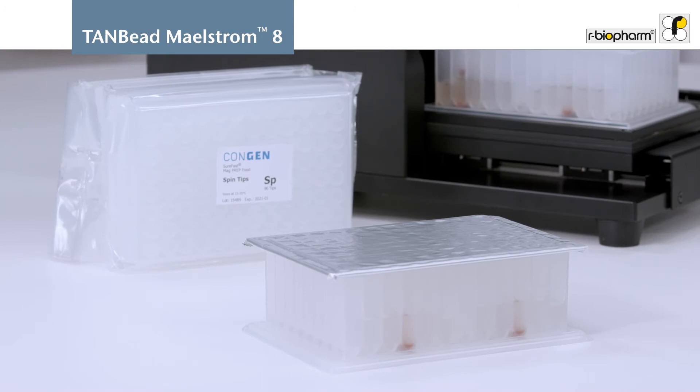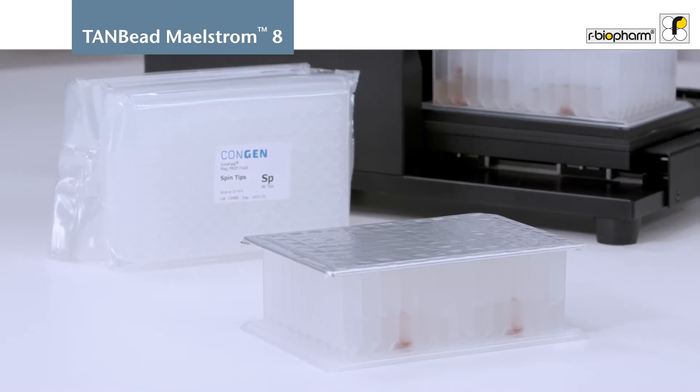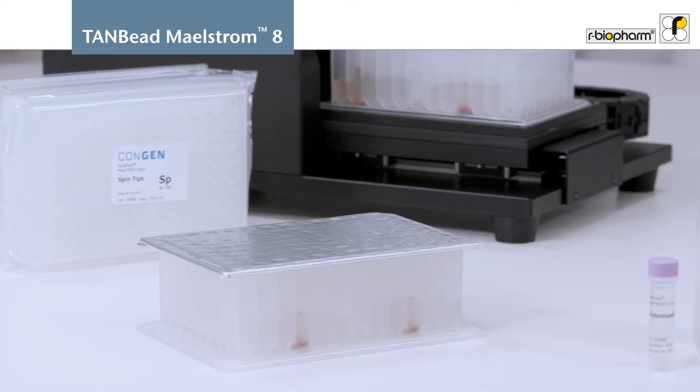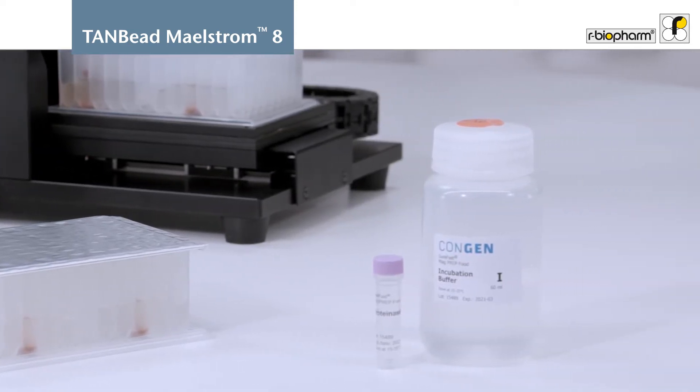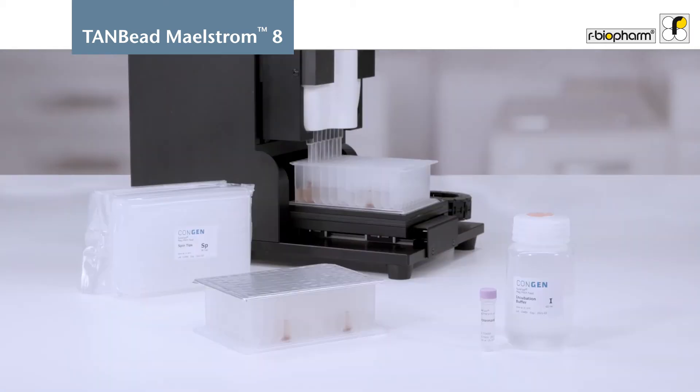The customized SureFast Mag PREP Food kit comes with pre-filled plates and is designed for the extraction of a wide range of food and feed sample matrices, making it compatible with all downstream SureFast real-time PCR assays.